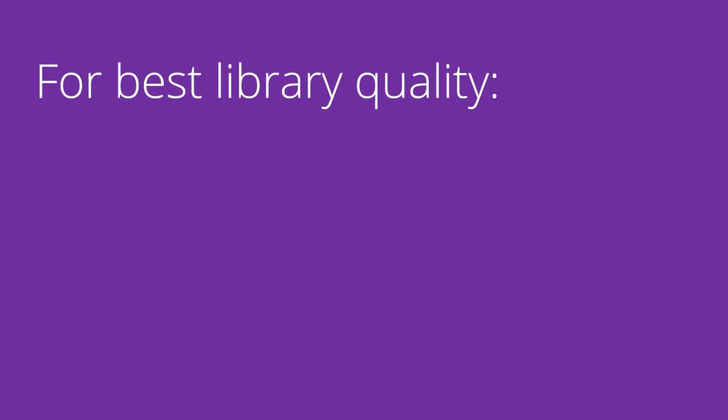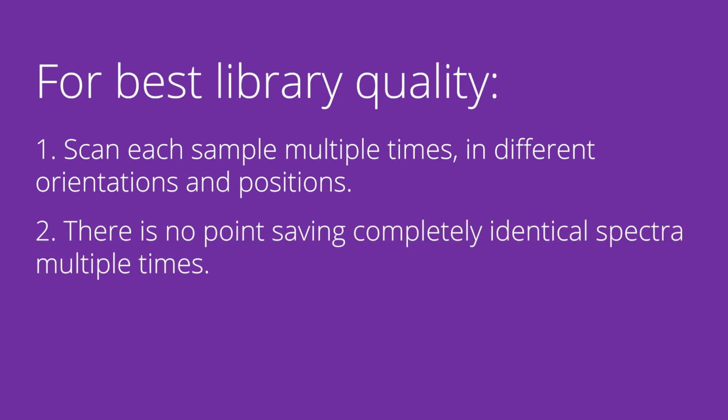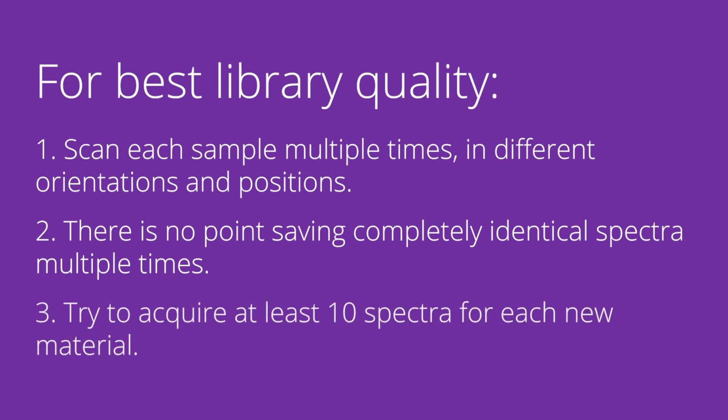For best library quality, scan each sample multiple times, in different orientations and positions. There is no point saving completely identical spectra multiple times. Try to acquire at least 10 spectra for each new material.